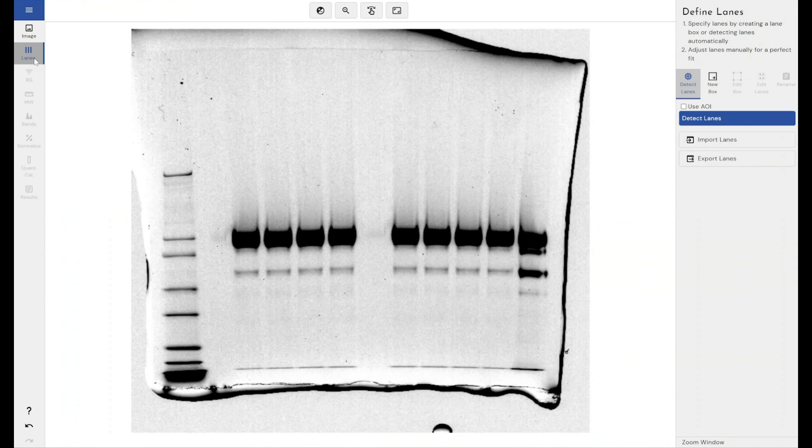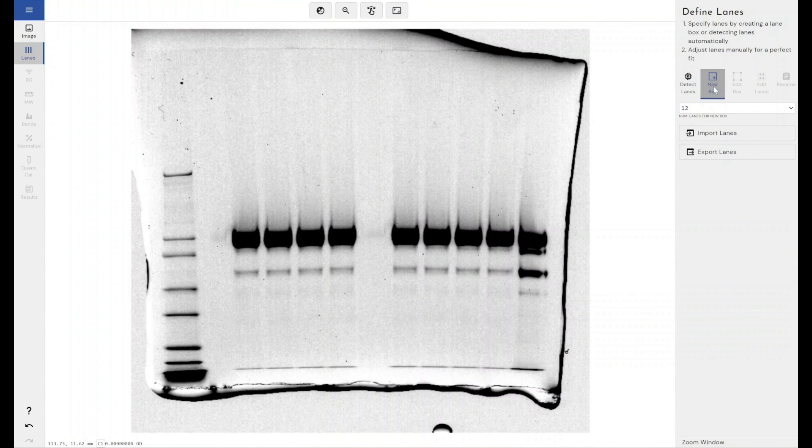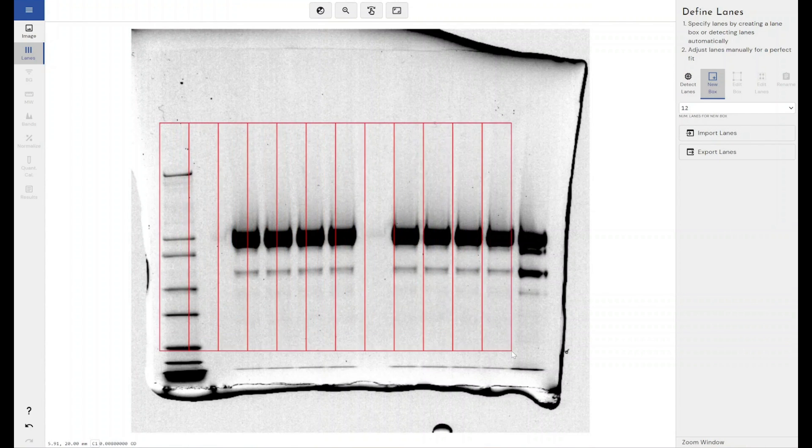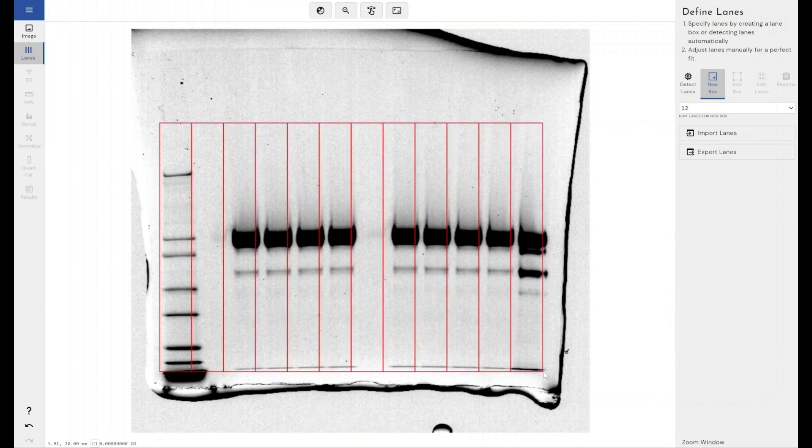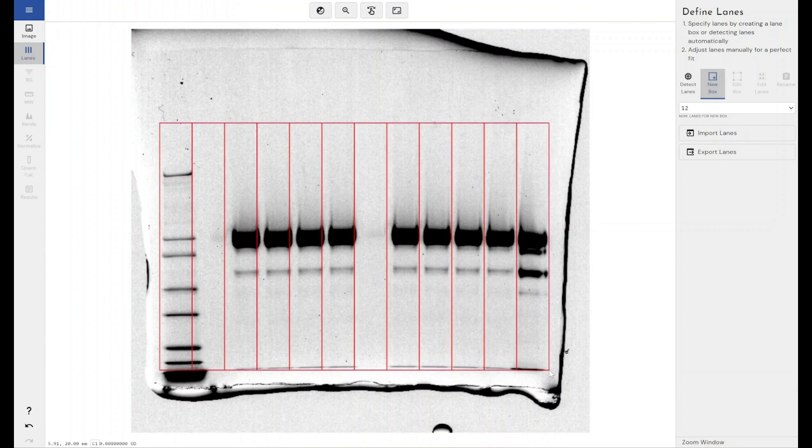So the first step we need to do is tell the software where our lanes are and, more importantly, where they start and end. Now I'm drawing a box across these lanes here.